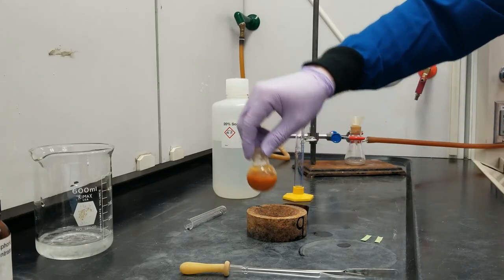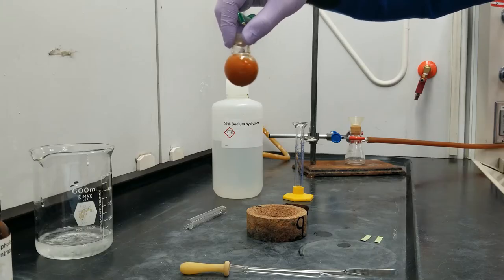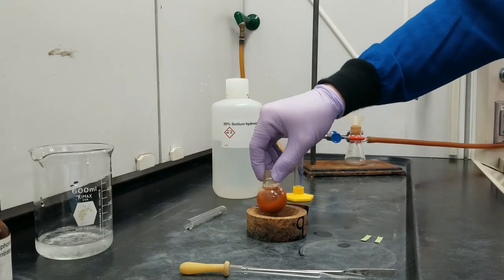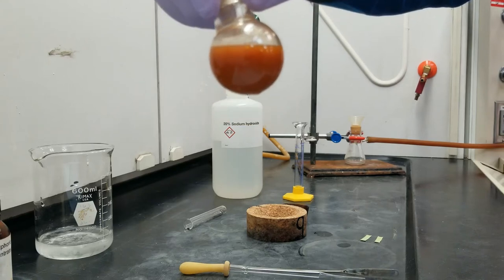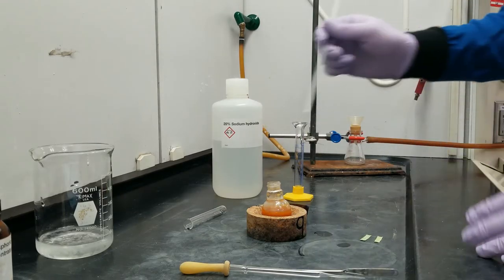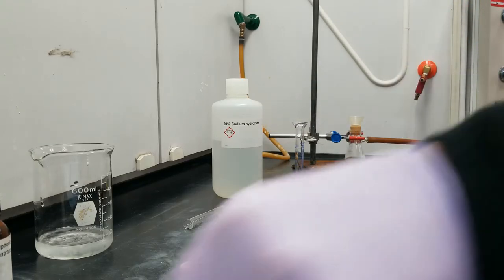So you can see that orange color. Mixture of ferrocene and acetylferrocene here. And if I slow it down, maybe you can see the little chunkies of solid floating around in there. And that's exactly what we're looking for. But let's go ahead and pH test it by dipping a glass stir rod in the solution and touching it to pH paper. And that's exactly what we were looking for here.